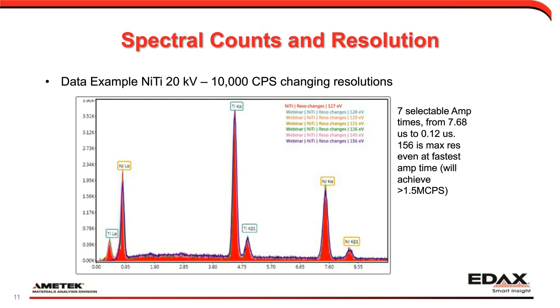So when you look at the premium detectors, one thing is the detector resolution. As I showed you, the resolution is a function of the electronic noise in the system, meaning that if you have a detector with a broad peak at manganese K alpha, that will also mean it has more noise inherent, and when you try to go faster, you will see a low energy cutoff earlier simply because of the base noise levels. So good detector resolution buys you two things: good resolution and a low noise system.